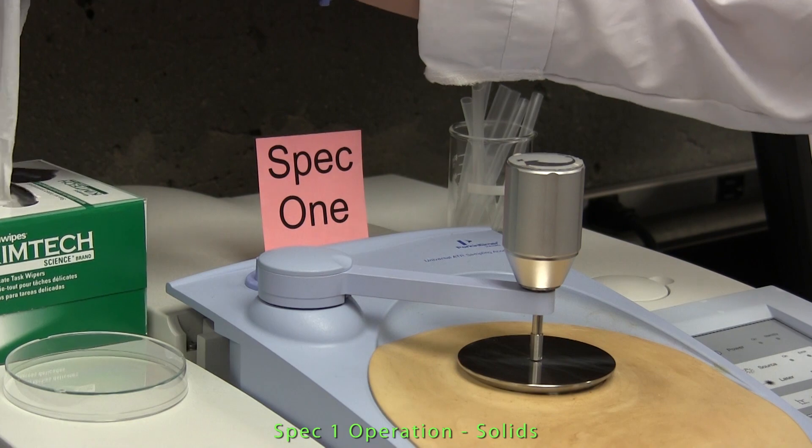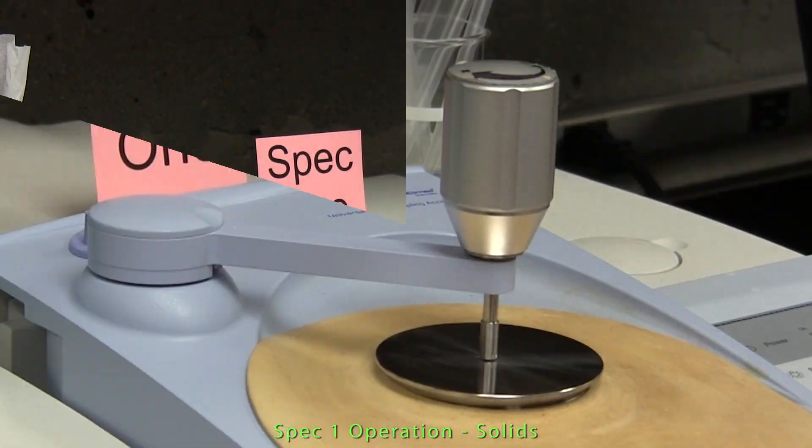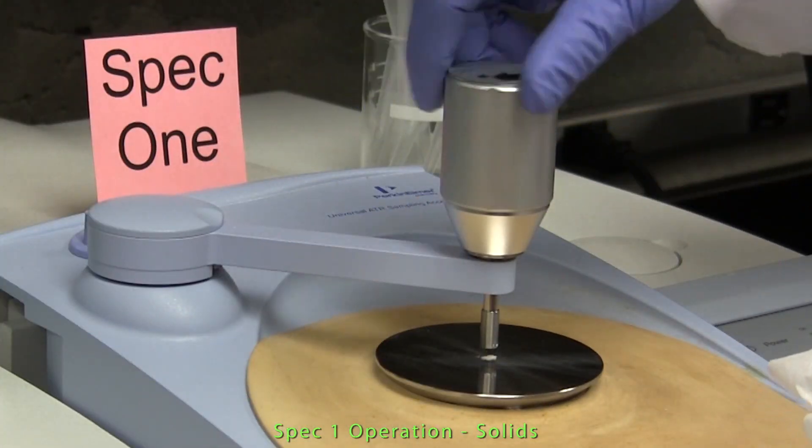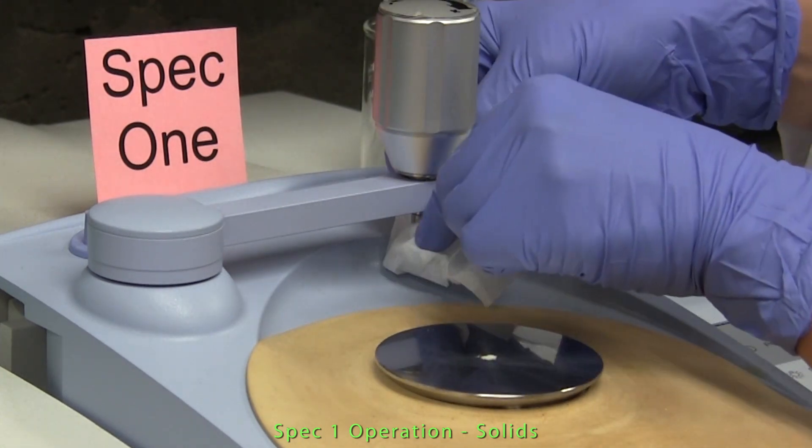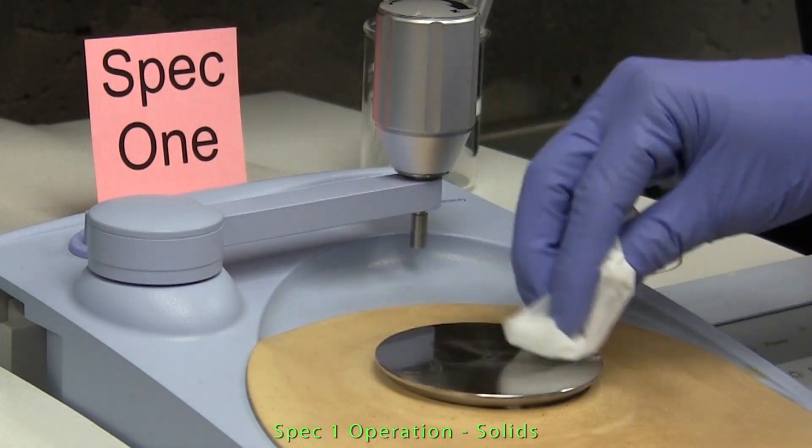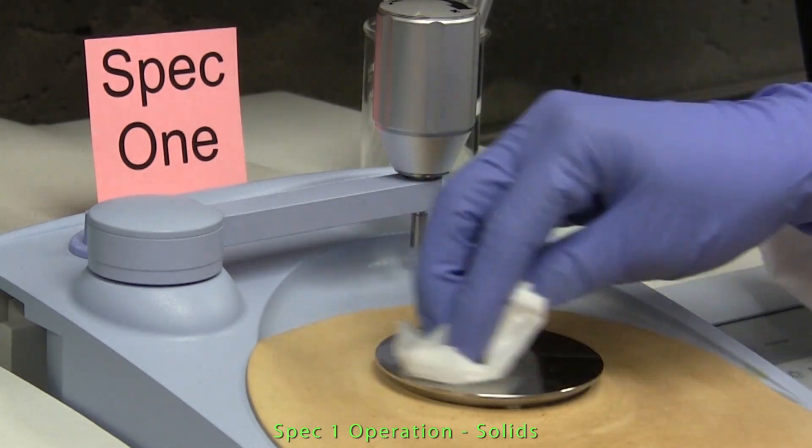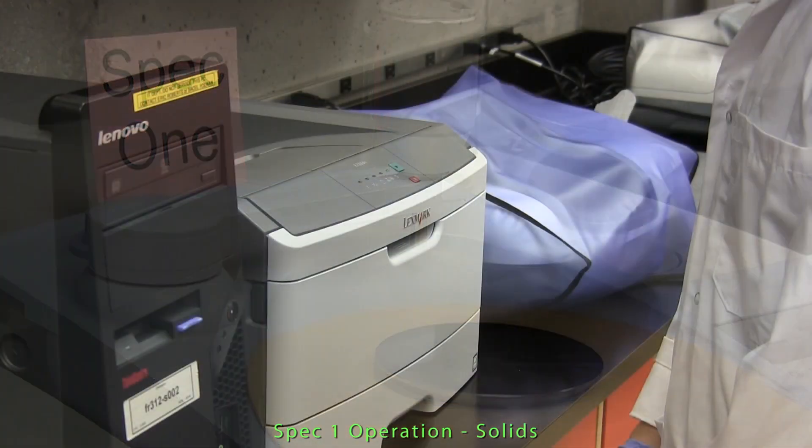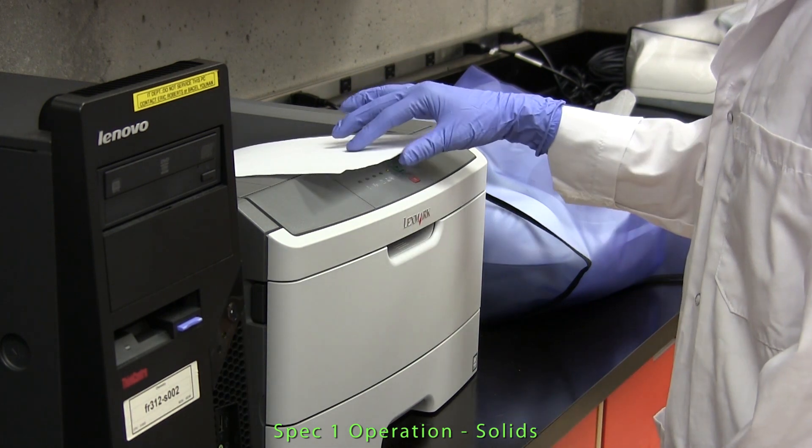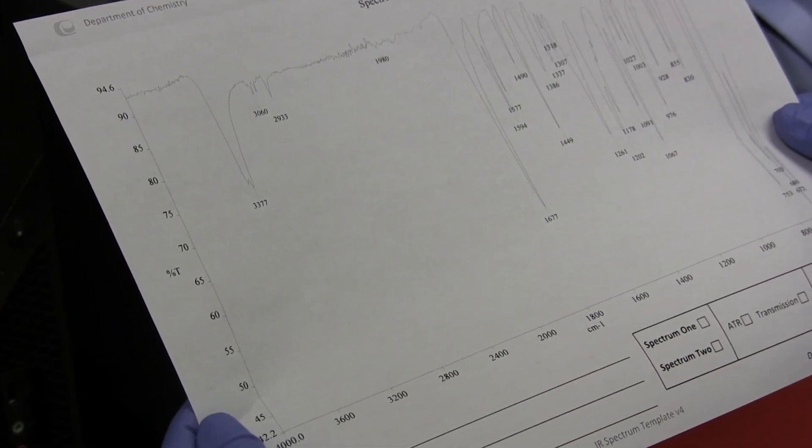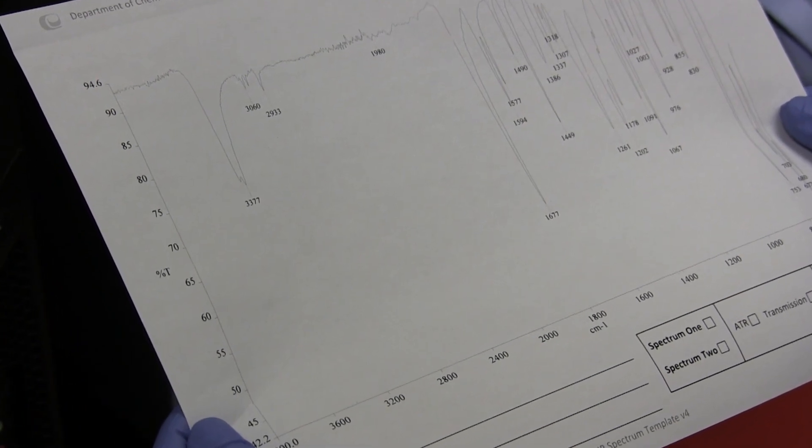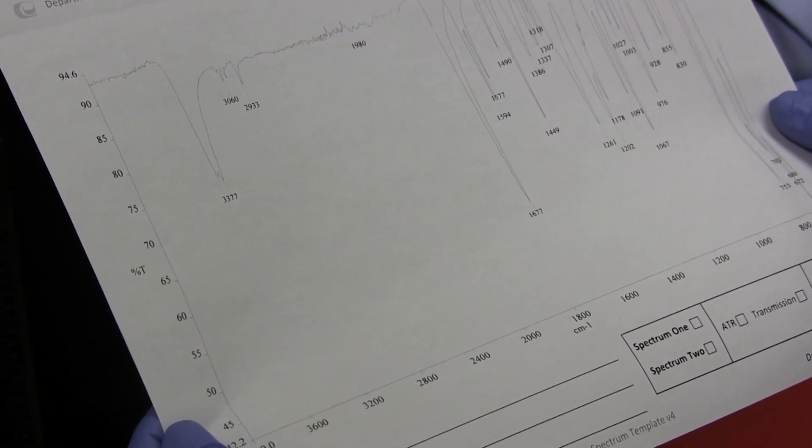While printing is being processed, you will be prompted to remove your sample and clean the mounting plate and crystal with an alcohol-moistened tissue. Now the spectrum can be collected from the printer. Details about the sample and instrumental parameters can be entered in the tables provided on the hard copy of the spectrum.